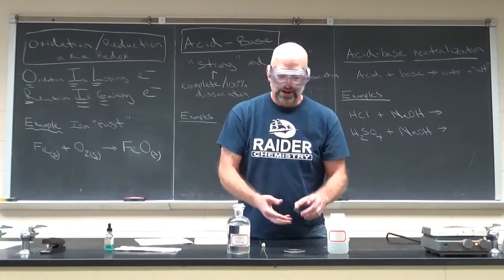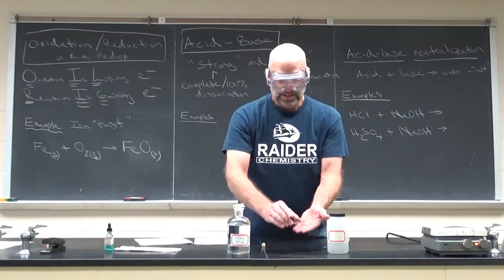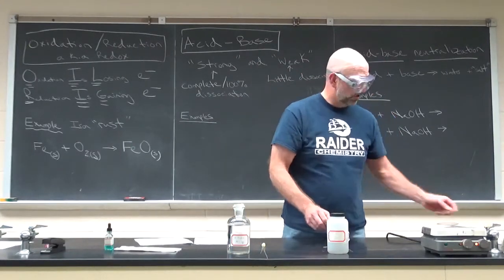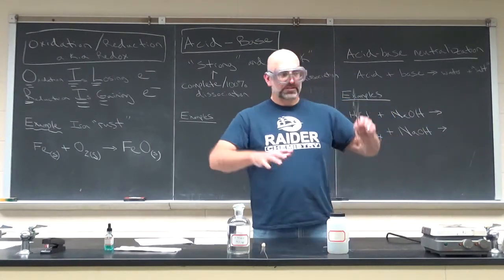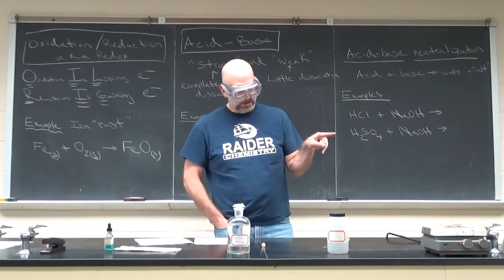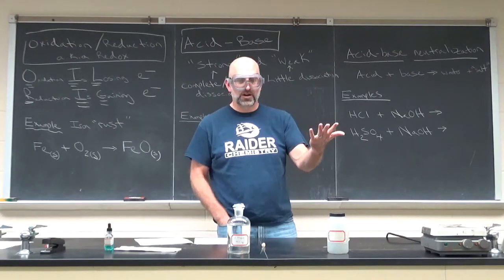So observations you can write down here. Take my word for it. A little bit of water vapor came off, and the reaction gave off heat, which is exothermic. So we've got the two mixed together, and now I'm going to put them on the watch glass. Hopefully that won't crack. If it does, I'll probably just jump a little bit, but I'm going to keep my goggles on. Okay, so we have to come back to this one. I'll refer to this reaction as HCl plus NaOH. It's an acid-base neutralization reaction, which I think you already know how to handle.